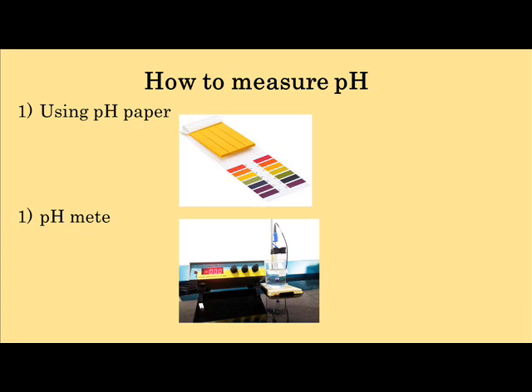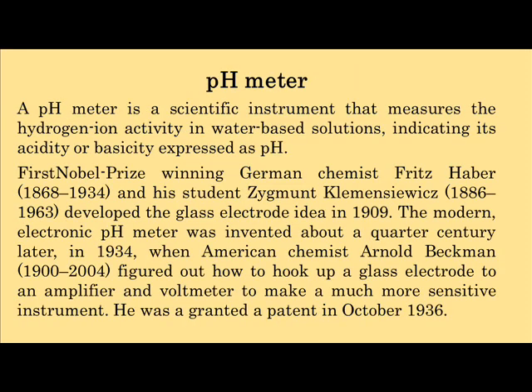pH meter measurement is quick and accurate. We can check the pH of a solution very rapidly, and it is time-saving. Portable pH meters are also used instead of a regular pH meter. In this slide we learn about the inventors of the pH meter instrument.